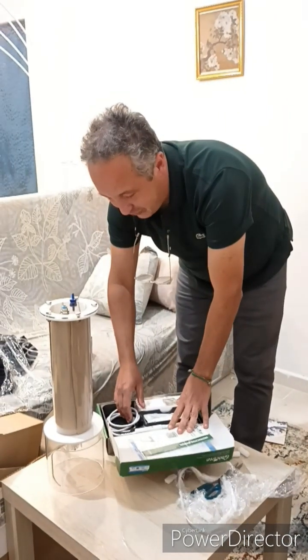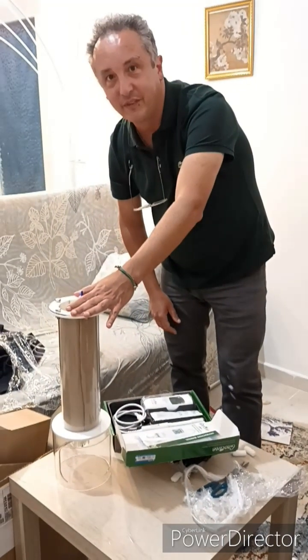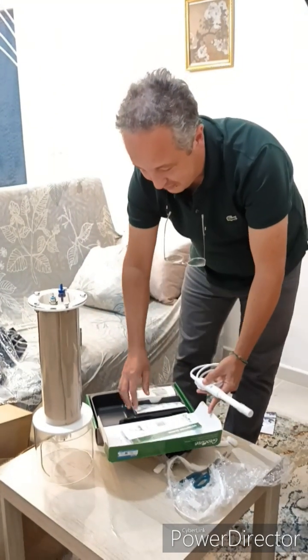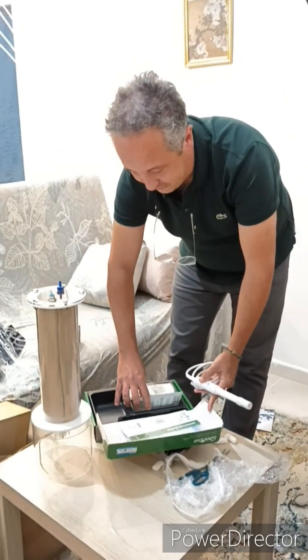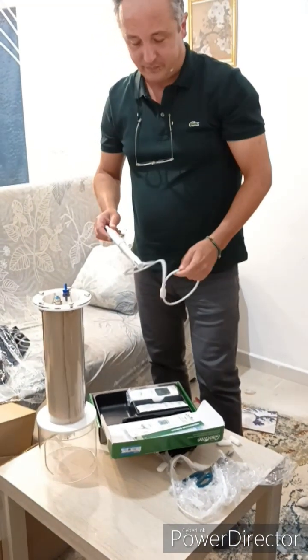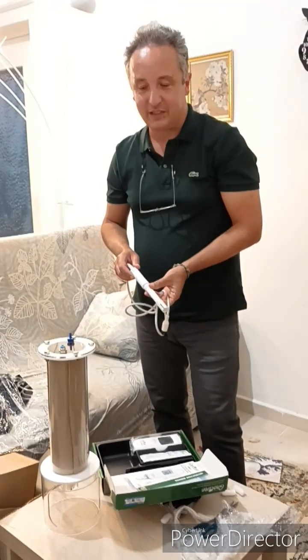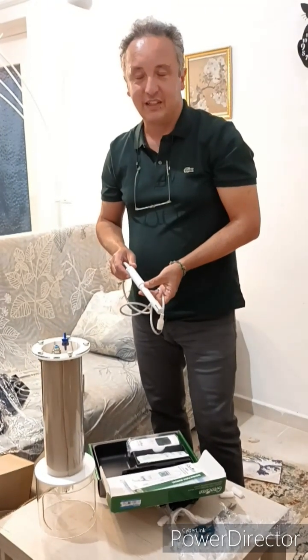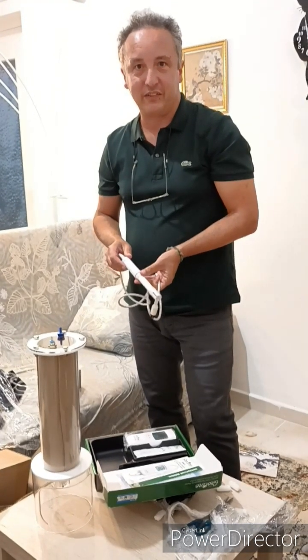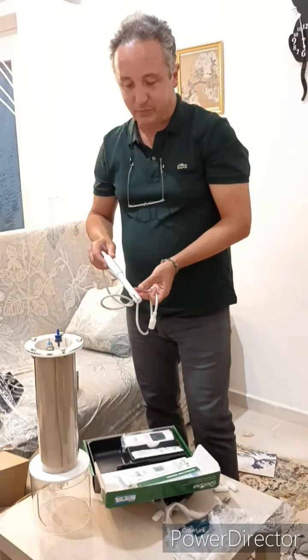Of course we have to measure the pH of the solution, so we bought this device. This device is a probe for measuring pH and electric conductivity, which depends on the type and concentration of electrolytes in the solution.